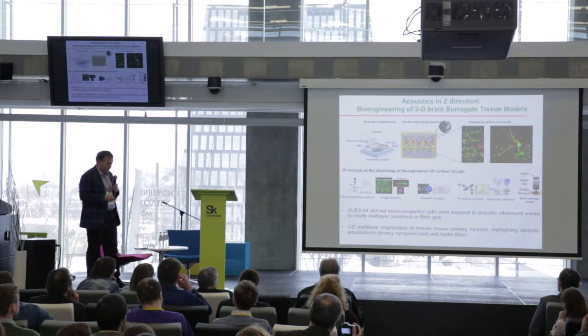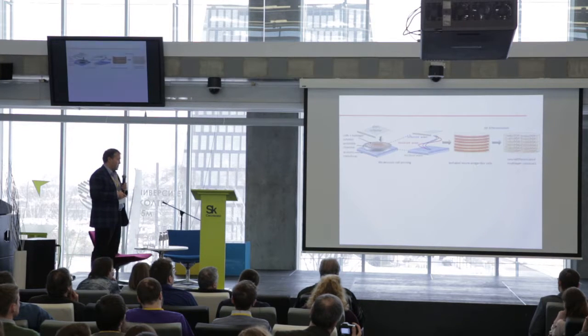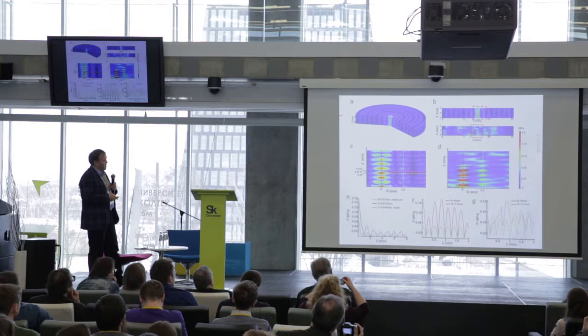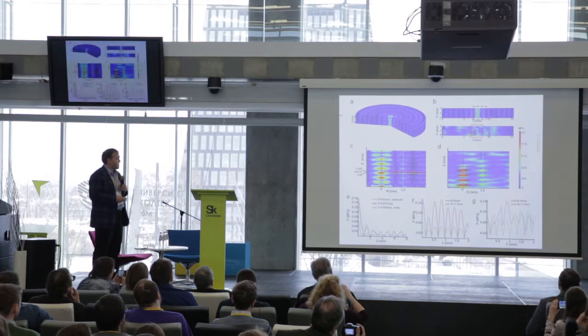And we started actually working on these with neural tissue engineering type applications. I won't go too much into our engineering work, but the idea is that you have cells in suspension, so you have to first get them into suspension. You turn on the acoustics, and depending on the wavelength, you will have these multiple layers that are well separated. So we've done some simulations. These are published if you wanted to look at them. These were published, I think, last month in Advanced Materials.